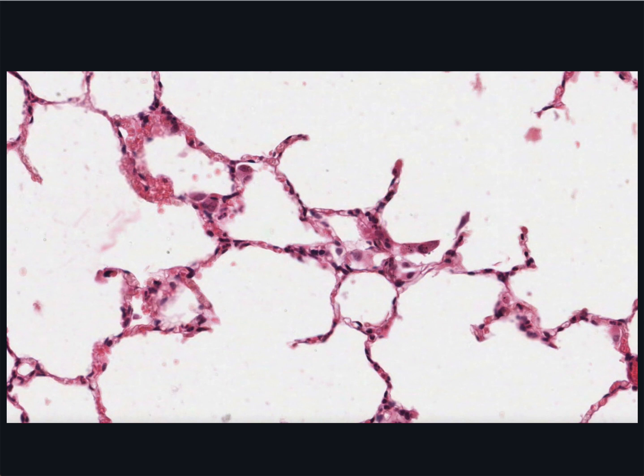Alveolar sacs have the same basic structure and function as alveolar ducts. They are merely the somewhat expanded tip ends of the ducts, or outpocketings, as I've referred to before.